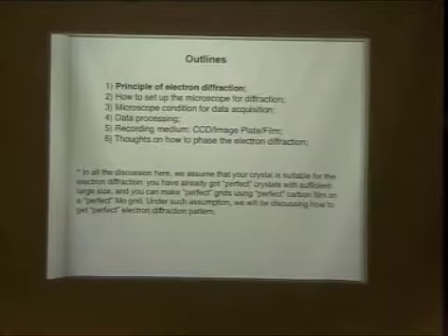But here, in all our discussion, we assume that you already have a very large crystal from crystallization of a membrane protein, large enough to give diffraction. And also you're able to make perfect grids, using this perfect carbon film, which people just talked about how to do, and using perfect molybdenum grids. On this assumption you can get diffraction. The question now is how do you get diffraction? That's what we're going to talk about.